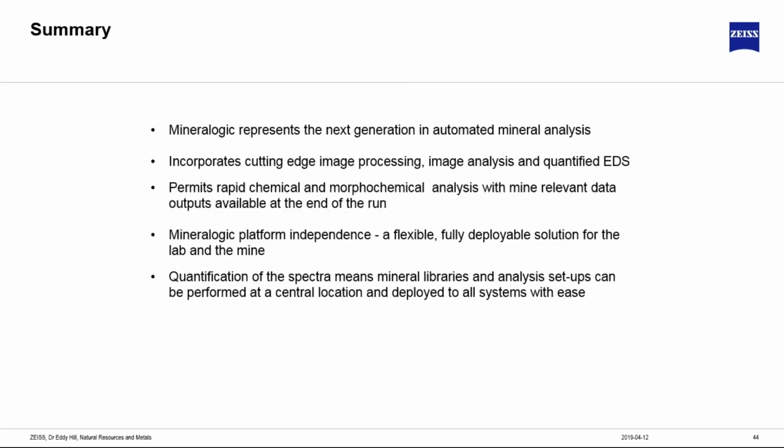So in summary, Mineralogic represents a next generation automated mineral analysis, incorporates cutting-edge image processing, image analysis, and quantified EDS, and permits rapid chemical and morphochemical analysis with mine-relevant data outputs available at the end of the run. It's platform independent, which provides flexibility. You can buy the right microscope for the task at any stage. And quantification of the spectra means that mineral libraries and analysis setups can be performed at a central location and deployed to all systems with ease.